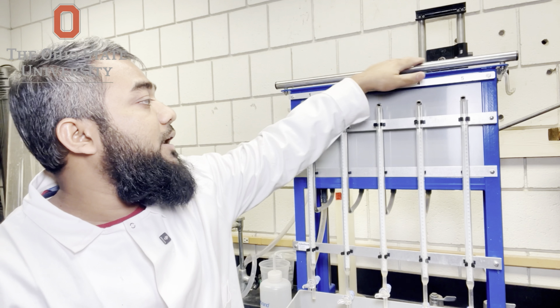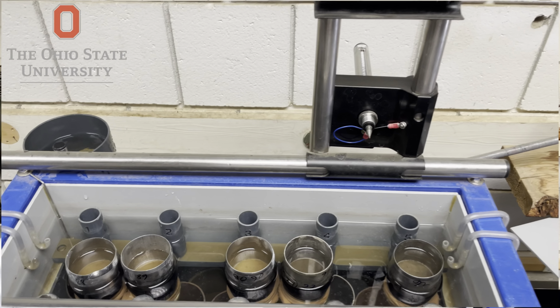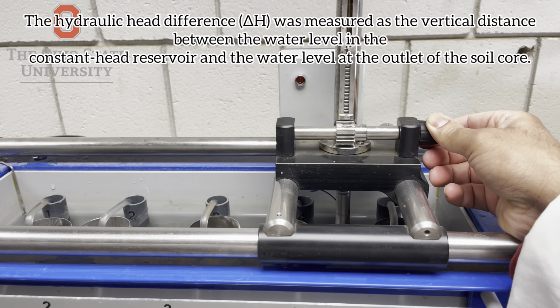The cores would be placed here. We could place 5 cores for this experiment per batch. And the outlet for collecting percolated water. The key requirement is to maintain a constant hydraulic head throughout the measurement.